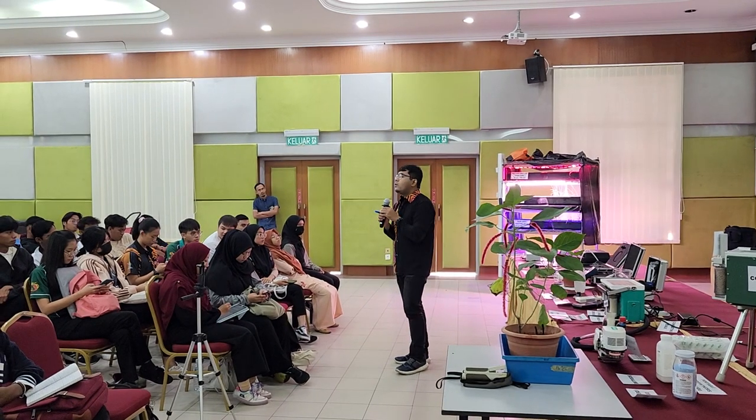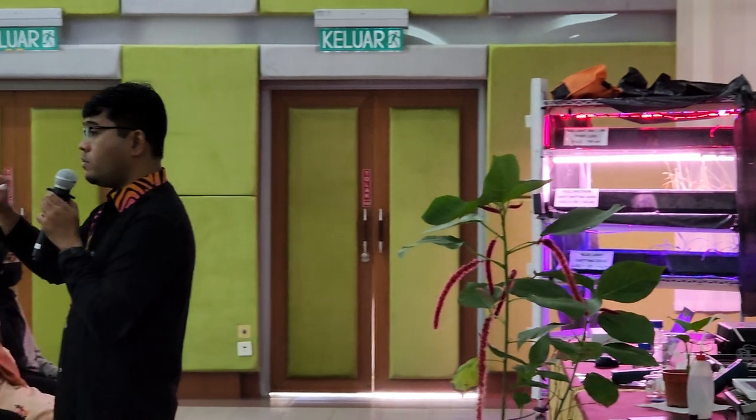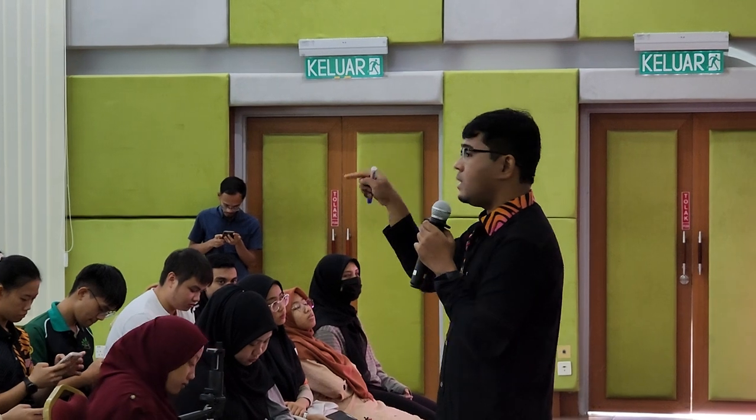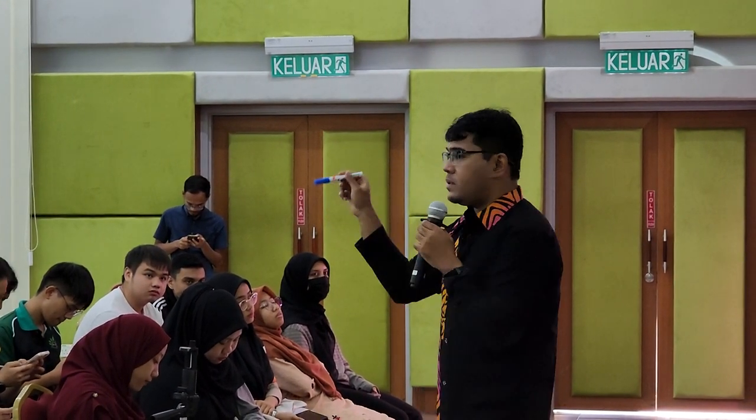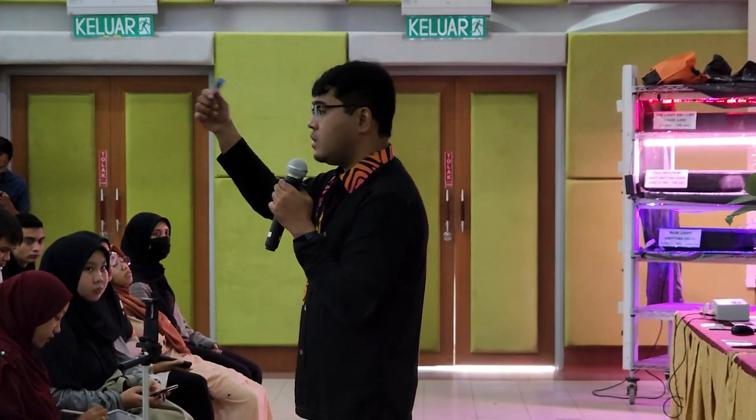That's all. For the hardworking and handsome uncle, okay, next one more level. It's not only that it is high, but the right kind of chlorophyll for photosynthesis is present, which is validated by this machine earlier. The chlorophyll needed for photosynthesis to be super high is chlorophyll A, which belongs to the reaction center. Remember, you learned your photosystem, there is a reaction center called P680. This P680 is in fact a special chlorophyll A molecule. The more chlorophyll A molecule P680 you have, the more active the photosynthesis is going to be.